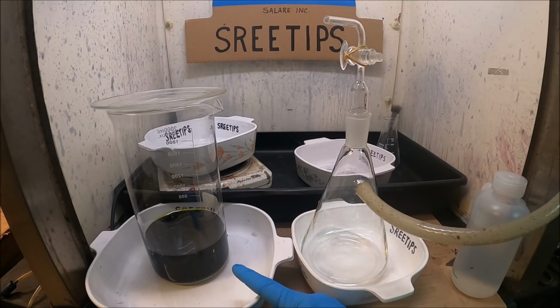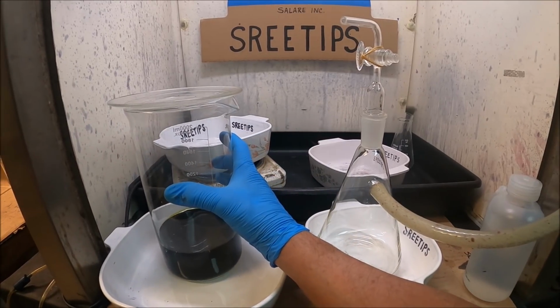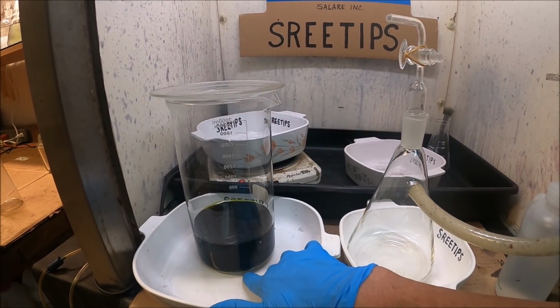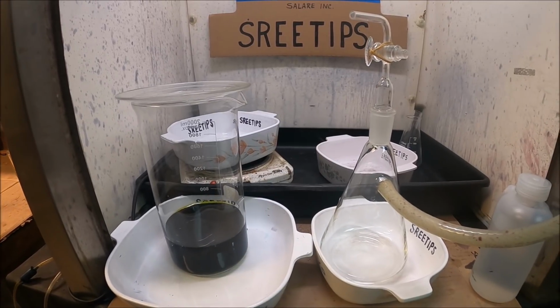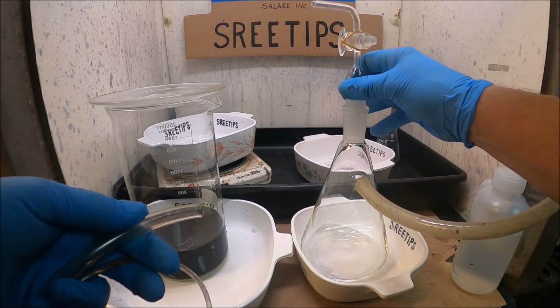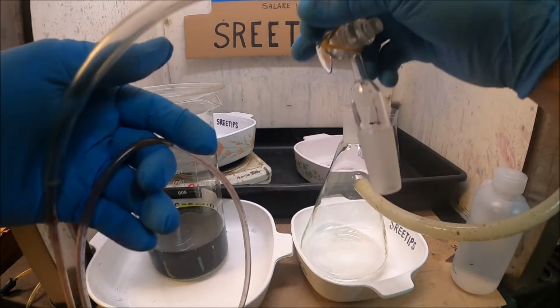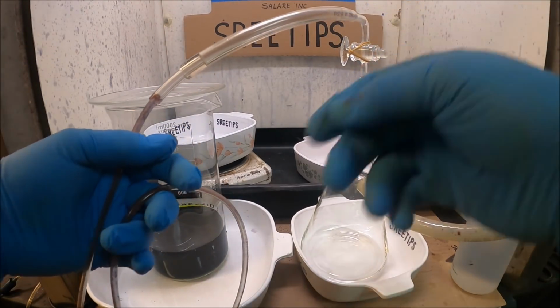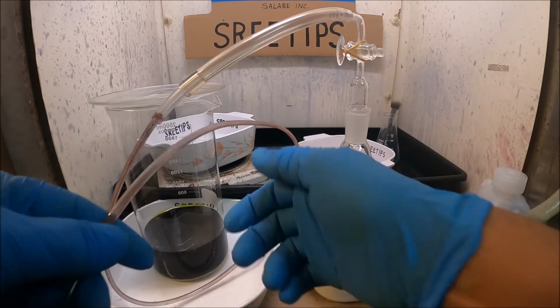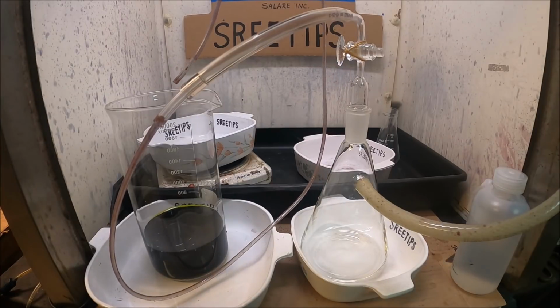Here's our gold foils that we have dissolved. Everything is in solution. It's got some sediment underneath of it, and I don't want to disturb that. Some stuff settled out down here. So what I'm going to do is I've got a vacuum flask set up, and I'm going to get this tubing hooked up here. We're going to draw off the gold bearing solution and collect it in this flask. Here we go. We're going to draw this off now.